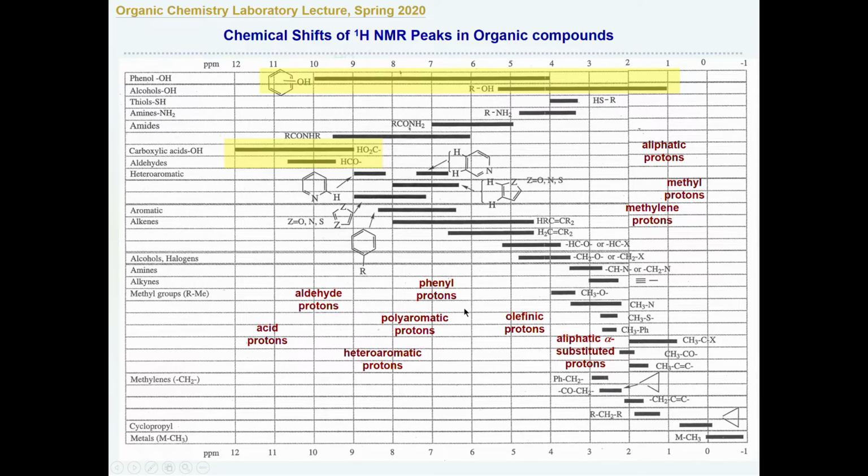And the other category is the pi electron. The pi electron has a ring current, so its magnetic field is somewhat different. That's the reason the C=C double bond is most likely in the 4 ppm to 5 ppm region, because the pi electron itself has a ring current, so its induced magnetic field center is not the same as the aliphatic. But regardless, the C=C double bond tends to be in this region, as I indicated.